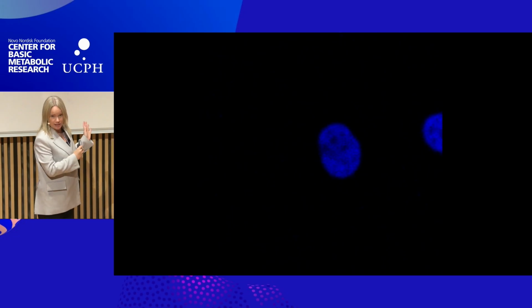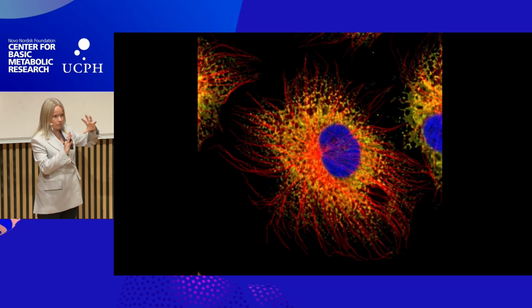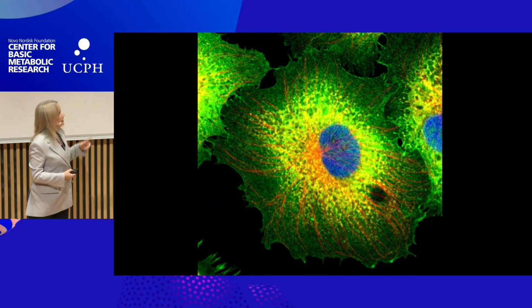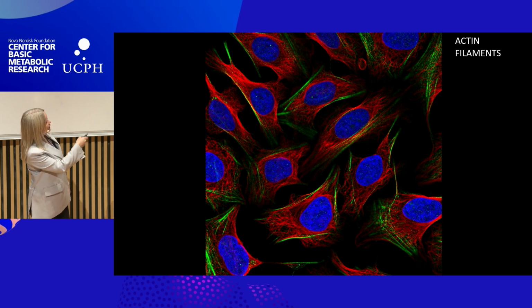So we do stain the cell with some reference markers: DAPI for the nucleus, an antibody-based marker for microtubules, and the endoplasmic reticulum, to get an idea of what the cell looks like, the nose and the eyes and the ears of the cell. And then on top of this, we use our in-house generated antibodies one at a time to study all human proteins. So this is CD44. It's on the plasma membrane of this cell. If an image looked like this, we'd look at this green pattern. It's the protein of interest, and we'll annotate and say this protein is in actin filaments.